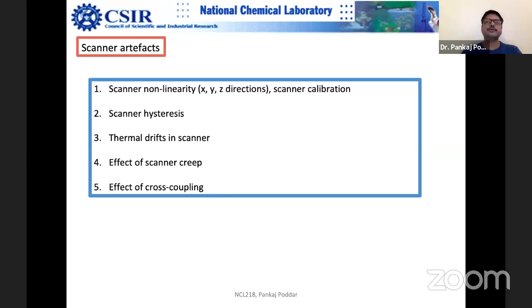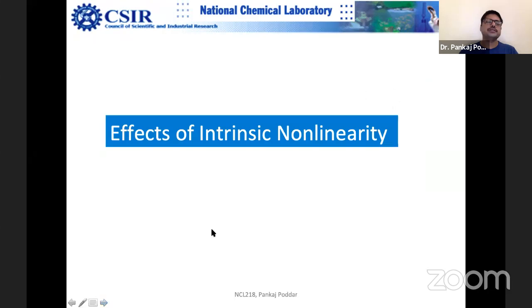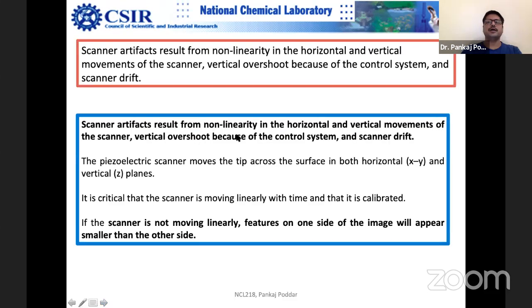Cross-coupling is another issue: you are trying to move in the X direction but there is cross-talk and some movement happens in another direction as well, due to the polycrystalline nature of the piezo ceramic. These artifacts result from nonlinearity in horizontal and vertical movement — vertical overshoot because of the control system and scanner drift. It is critical that the scanner moves linearly with time and is properly calibrated. If the scanner is not moving linearly, features on one side of the image will appear smaller than on the other side.